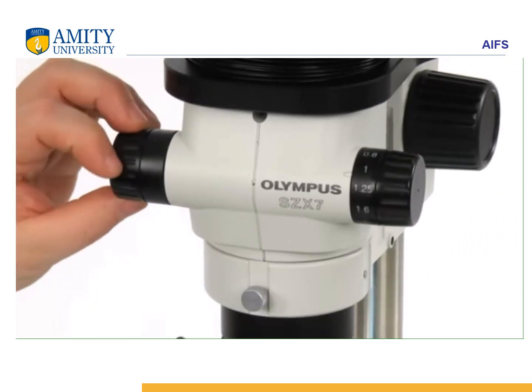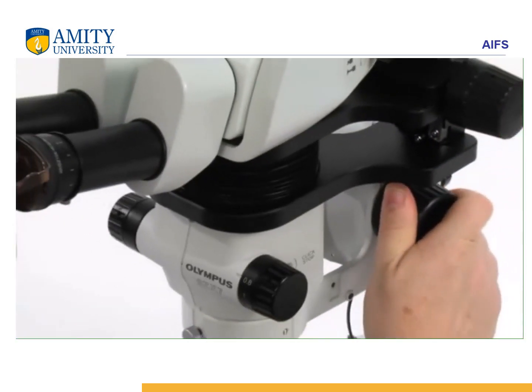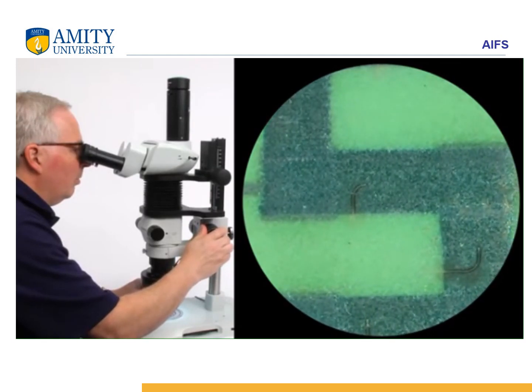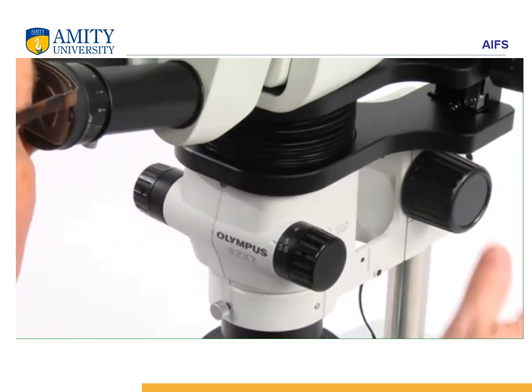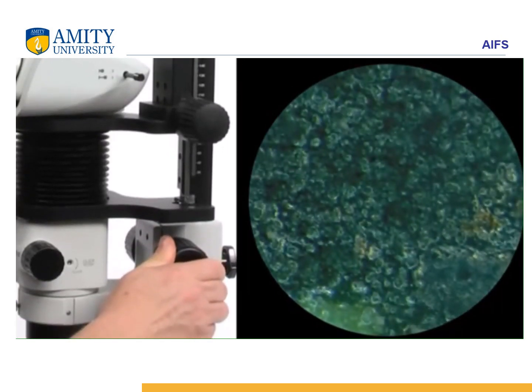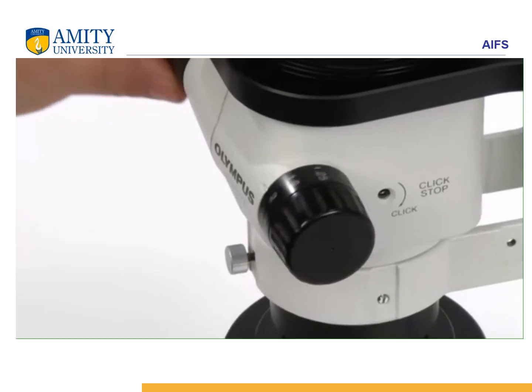This is adjustment. Again it is being adjusted. You all know what is coarse adjustment and fine adjustment. This is related to parfocality. You can see different types of grain under it.